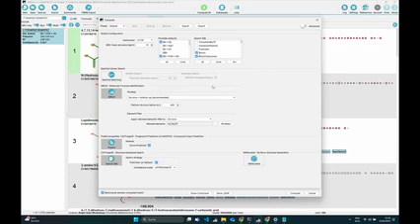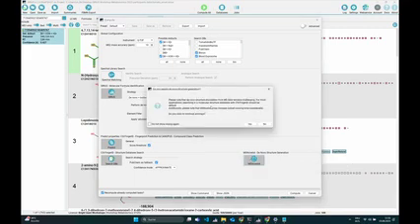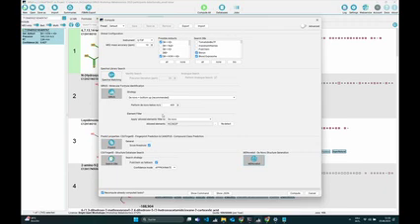But the only thing that we want to do here now is turn on this MSNovelist button to perform de novo structure generation. So we just click on this. We'll get a warning, do we really want to do this? And we want to. And what you want to make sure, because we already have computed fingerprints, we have identified formulas and so on, we want to make sure that we don't recompute everything that we have done already. So you want to uncheck this recompute already computed tasks. So make sure that this checkbox at the bottom left is disabled. And if you have enabled MSNovelist, you can click now on compute.